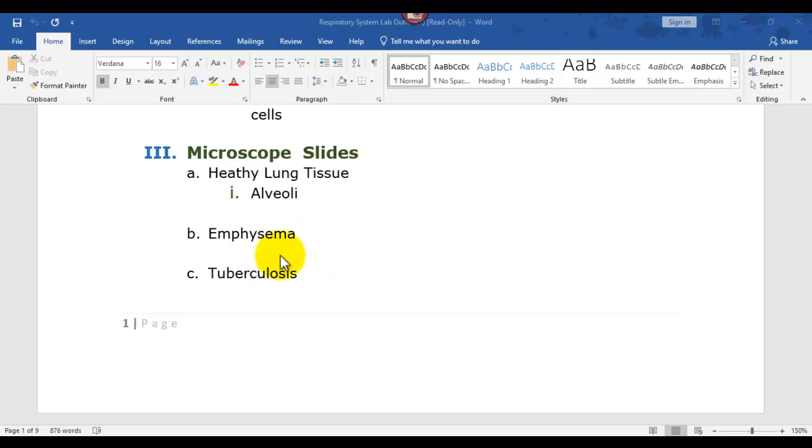People with emphysema are short of breath. Tuberculosis causes dead tissue, so what you look for with that are the dark areas, necrotic tissue where it's dead or scarred up. It does damage the alveoli as well.